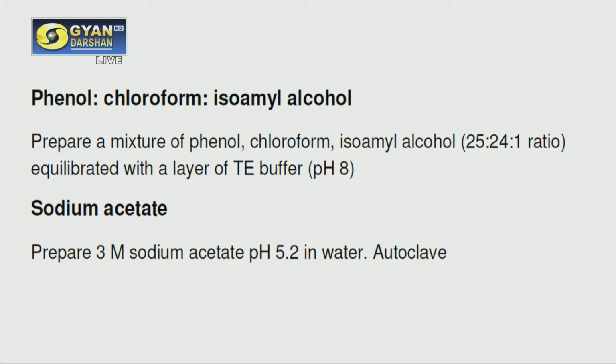So all the chemicals or all the buffers that you use should be properly prepared and autoclaved. Without autoclaving you cannot do it, because otherwise the DNA will be degraded. So you have to prepare all the buffers, autoclave the buffers, and any chemicals, even the glasswares and the plasticwares that you are using. Even the water, not only double distilled water, but the water also has to be autoclaved, sterile, and then you can perform the experiment. Now the procedure.